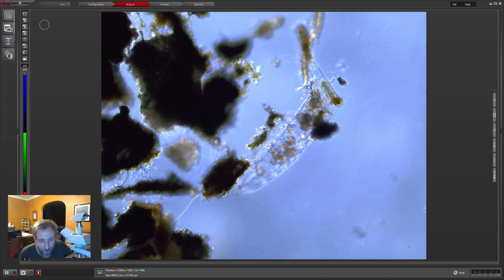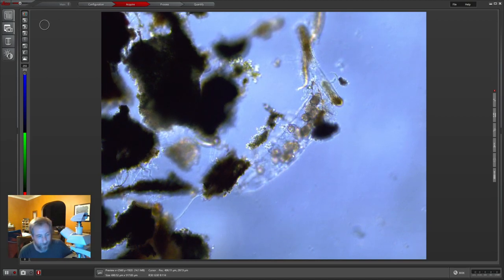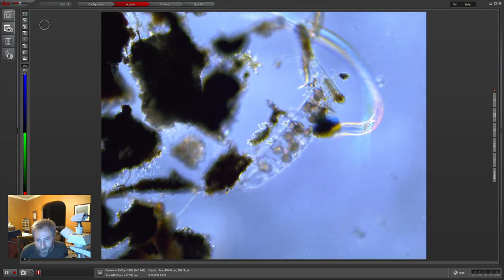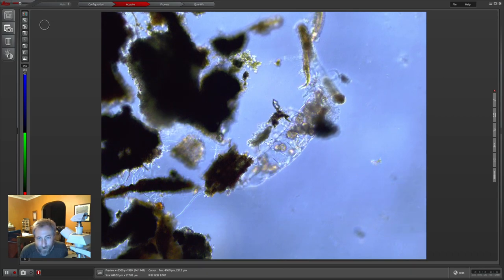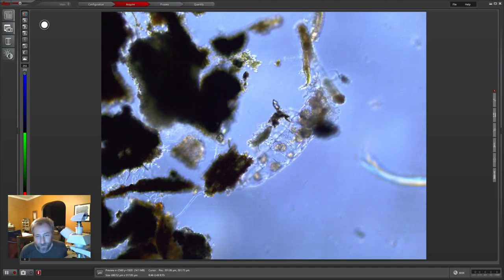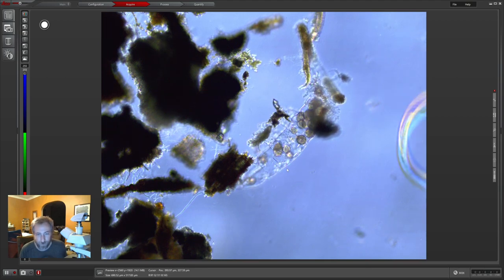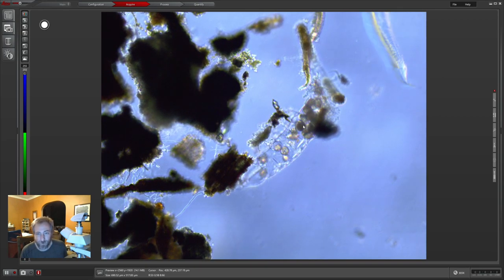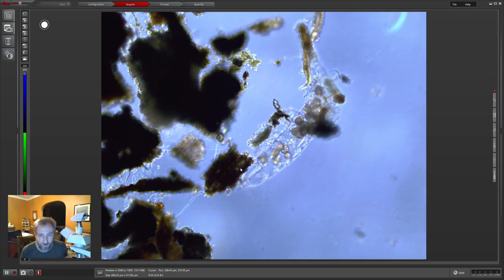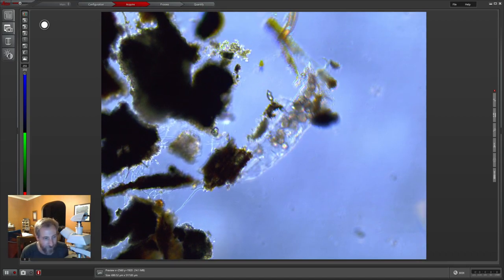Crazy worm stream — and water bears! And these are little water bear eggs. You can see them moving around inside of the molt. I'm pretty sure they're little water bear eggs crawling around inside of the molt. When the mother water bear sheds its skin, it leaves the eggs in the skin — so this is where we would expect to find them. This is their general shape. It's kind of cool because I've never seen them moving around before. I have found some eggs in a molt before, but they were a little bigger and weren't moving at all, so I don't know if that's what happens — they get a little bigger and then settle down, or maybe they don't stay wet the whole time.